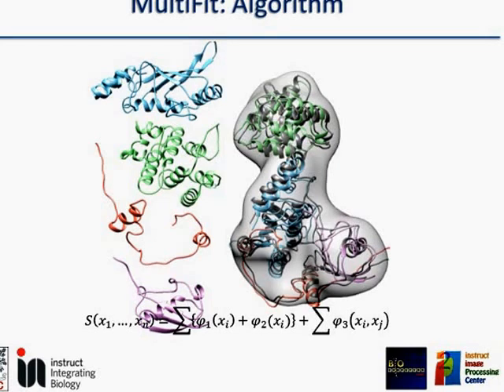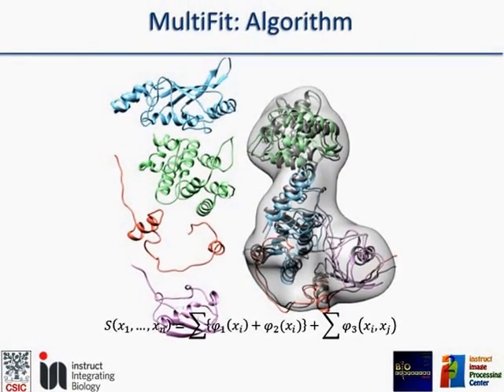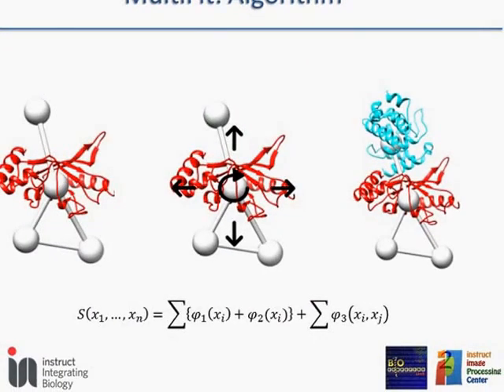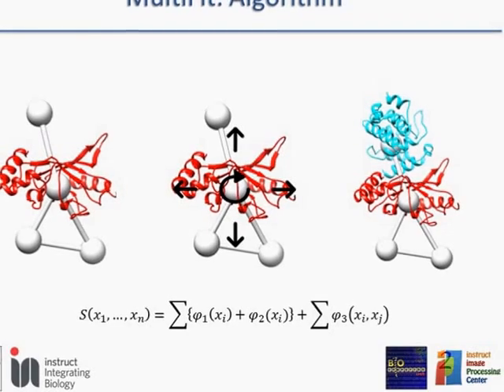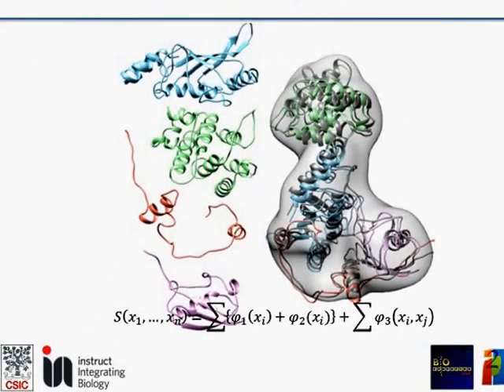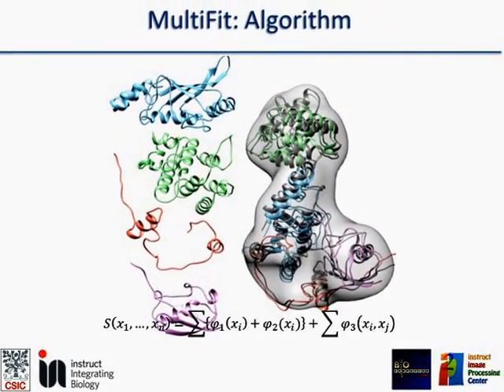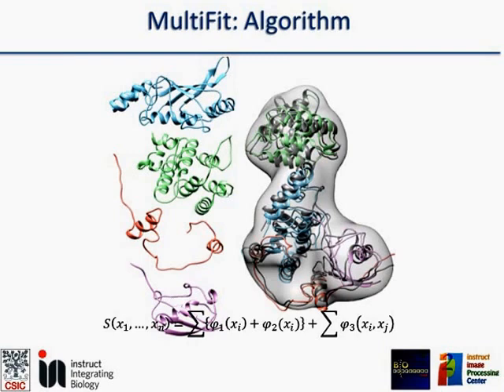It is using PatchDock to finally get the structure between the different proteins in my complex. So what it's doing is selecting by default the 10 best scored structures and applying docking. And these new structures obtained by docking are incorporated into my potential results and also evaluated with this function again.